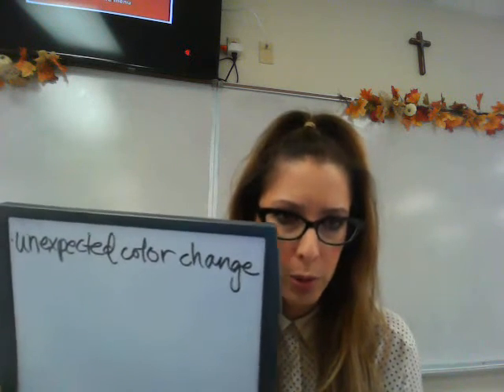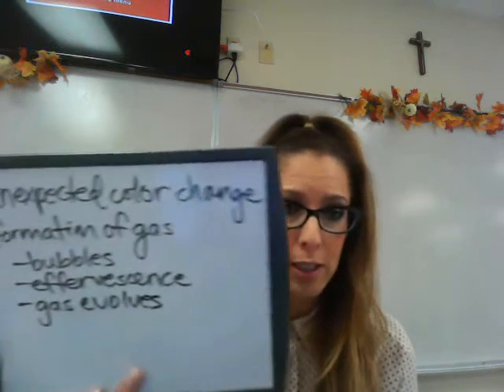You may also observe the formation of a gas. You may describe that as bubbles formed. Chemists like to use the term effervescence. Sometimes they'll say gas evolves. We love to make things more complicated, okay?